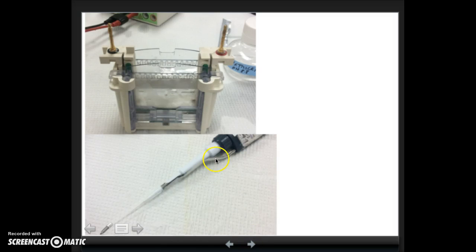From there, we can load our samples into various wells. I used a regular P20, but you can get gel loading tips. These are specialized tips that are narrow and a little longer so that you can insert the tips into the well and slowly release your sample. The sample buffer also contains some glycerol to make it denser than the water. So when you release it into the well, the sample sinks to the bottom and you don't have to worry about it mixing with your other buffer.